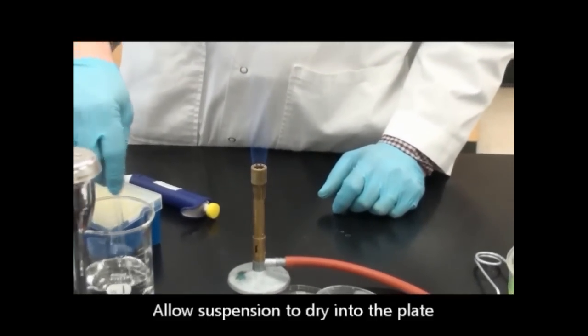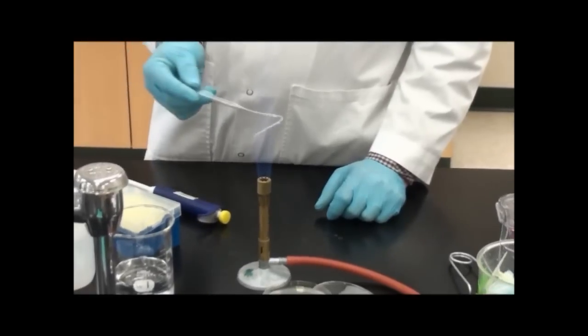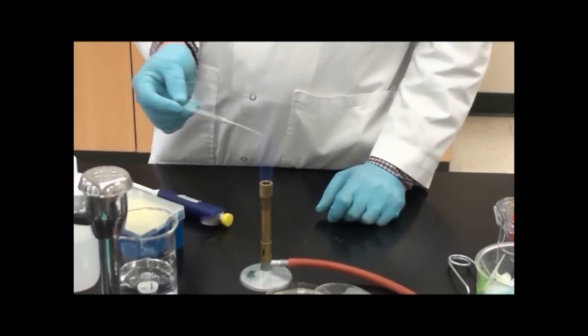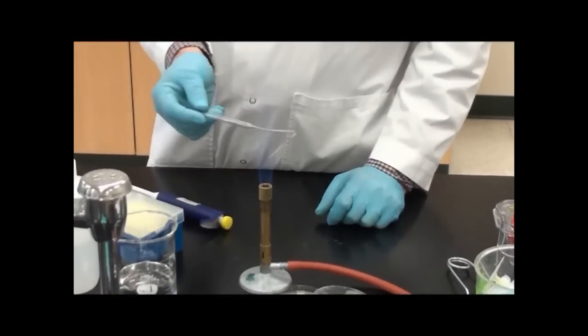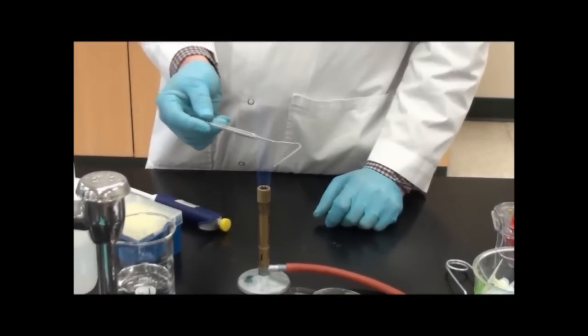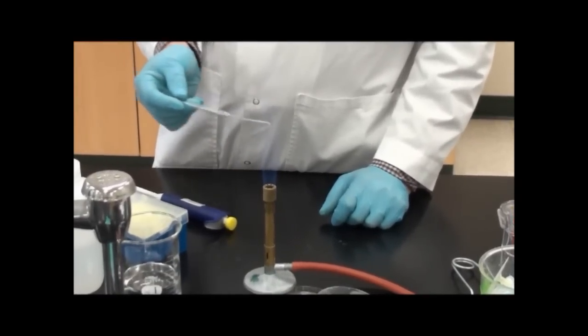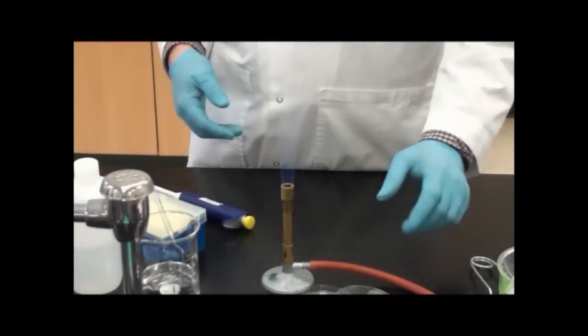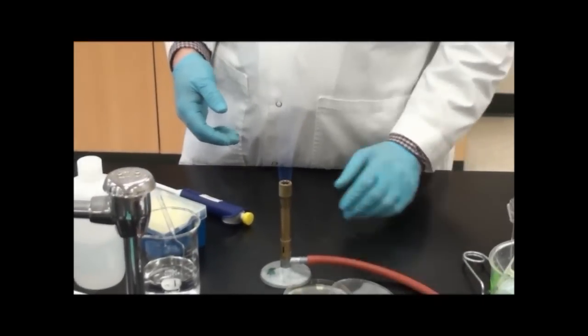I'll take it and put it back behind the Bunsen burner. Just sterilize with alcohol and run it through the flame a second time so it's sterile for the next person coming in. They'll probably flame it again when they go to use it.